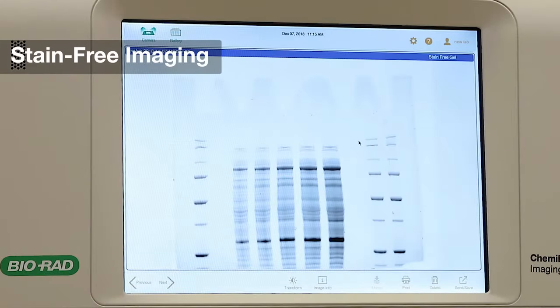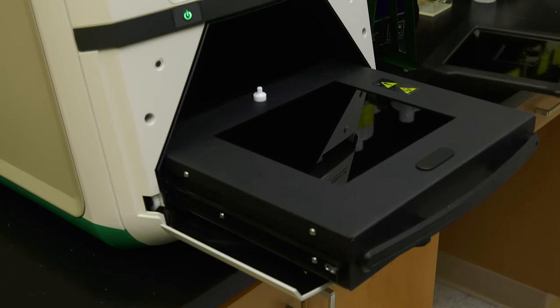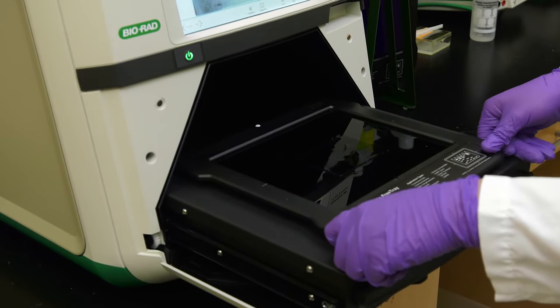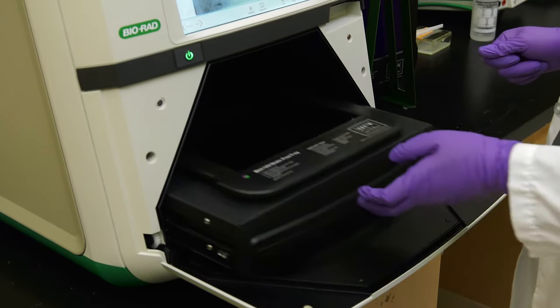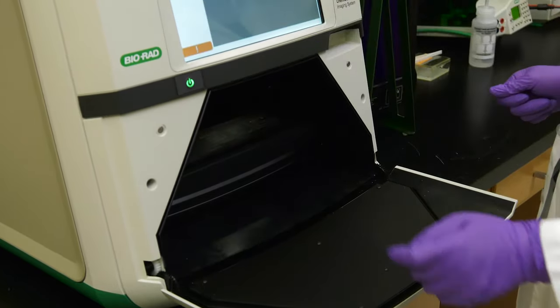Bio-Rad's stain-free gels are an excellent alternative to Kumasi Blue. No staining or de-staining is required, just a simple 45-second UV activation step. After you've completed electrophoresis, place the stain-free gel directly on the UV tray. When you are satisfied with the position, push the transilluminator back in and close the drawer.